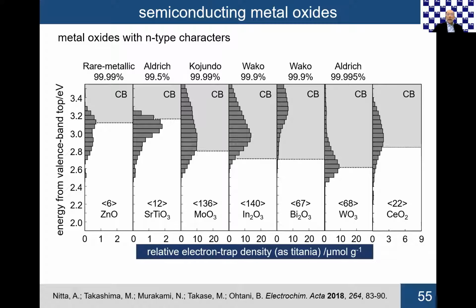However, even using the relative density, it is possible to check the similarity or difference of samples.